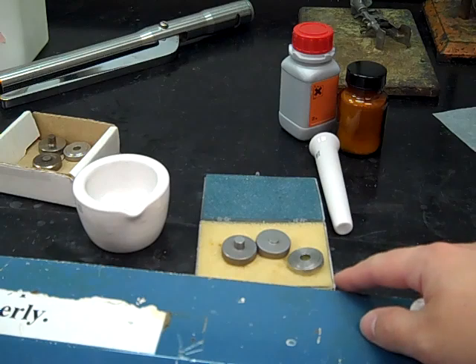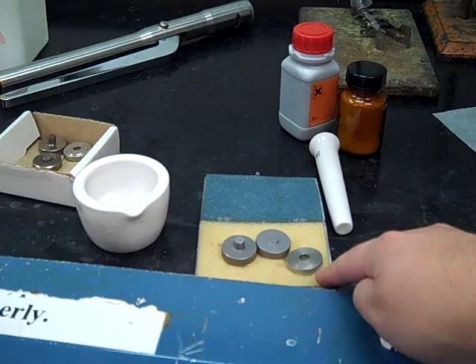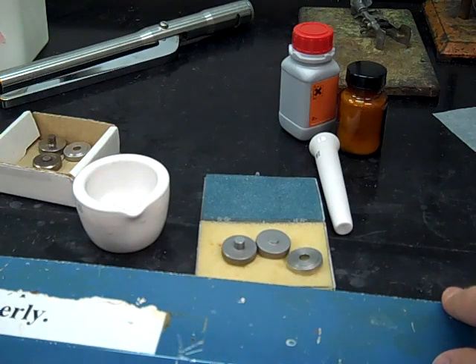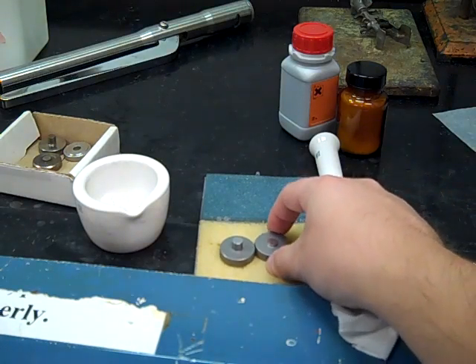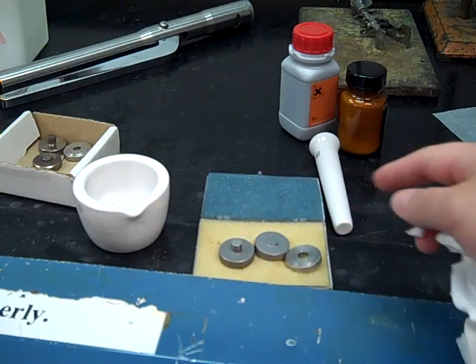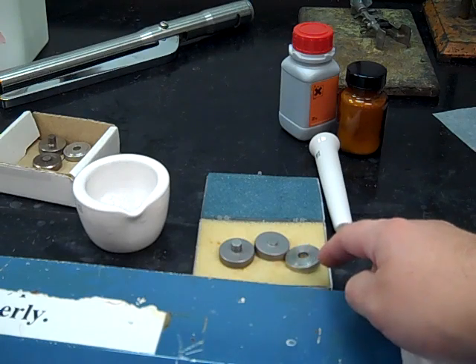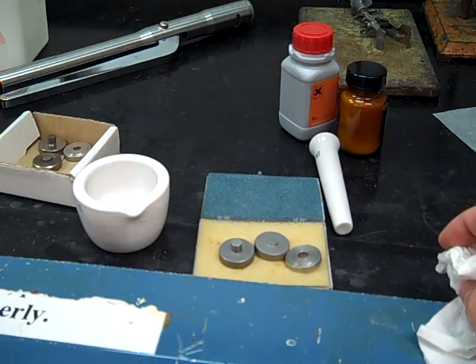One key to success before you start the IR is to make sure that all 3 pieces of the pellet press are extremely clean, and that both your mortar and pestle are clean and there's no solid left in there from the last person who did the run. If these are dirty, it's going to be even tougher to make that IR pellet. So after you get done running, make sure it's clean, and before you start your run, make sure the person before you had it clean for you. You're probably going to want to rinse them with water and then maybe dry them off with a chem wipe. That's really important to making sure this process is as smooth as possible.